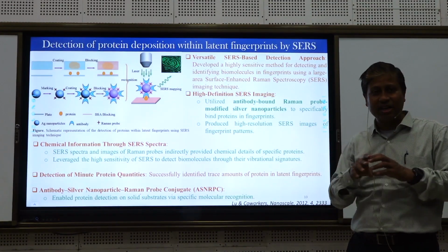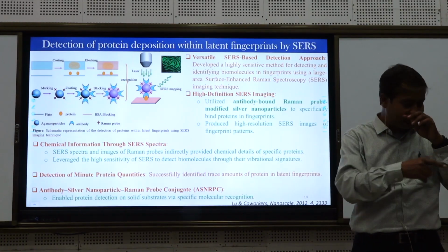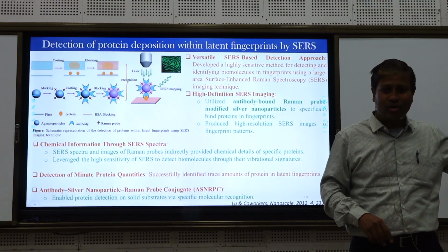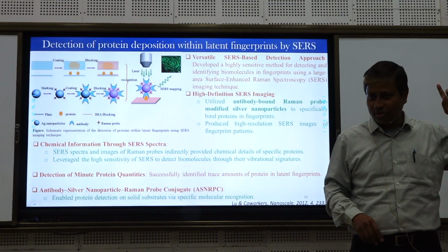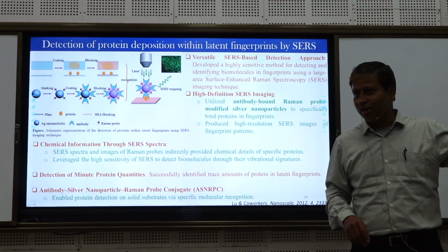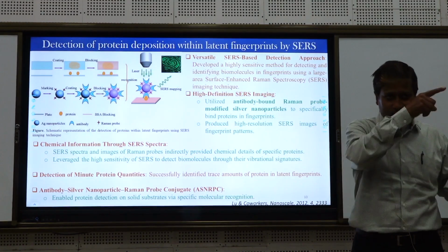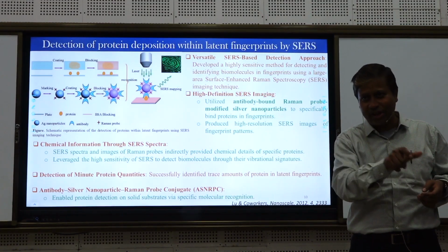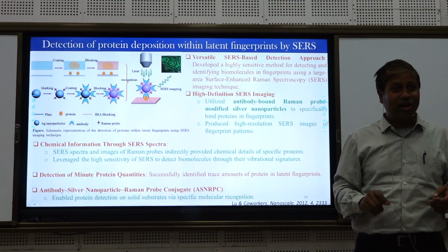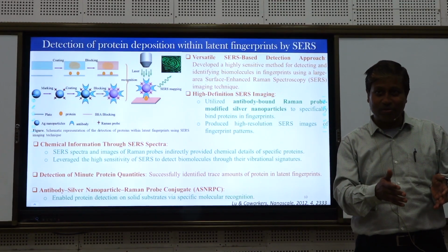Many spectra today also, you will see, will appear like there is no change. Yesterday I noticed that when Professor Hiramatsu was recording the glucose solution, he felt like it was water. He initially thought it was water because of the strong water band, the OH stretching and then bending. And then when somebody told him, no, this is the glucose solution, immediately he became careful because it appears like a water solution.